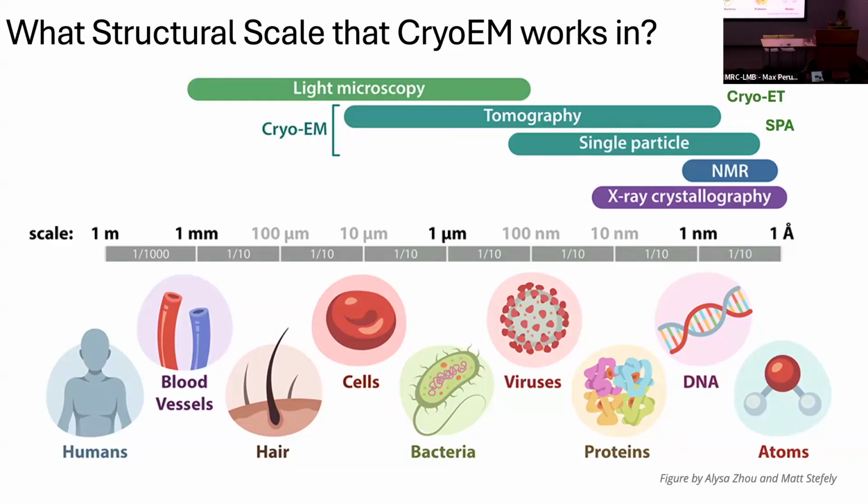Of course, for EM, the electron microscope's ultimate resolution is much better than 1 angstrom. It's 0.6, 0.7 when we do the Young's fringe. So if we have a favorable sample, for example gold or a very thin material, you can see the columns of atoms. There's no problem with the microscope having this power, but the problem is the sample. The biological sample is very easily damaged, and has very low contrast because it is made of very light elements. So all of this sets the limit for cryo-EM.